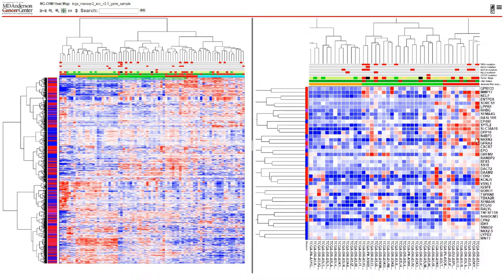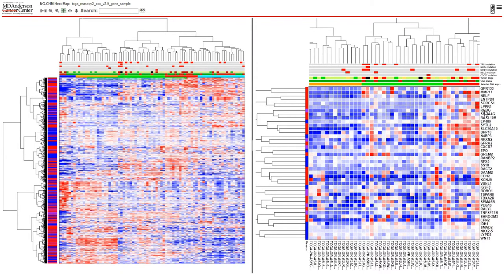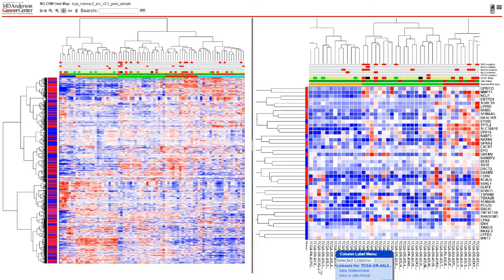The available menu entries depend on the type of data in the map. In this map, row labels are gene symbols, so the row label menu contains link outs to gene information. In contrast, the column labels are TCGA sample identifiers, so the column label menu contains link outs to information about TCGA samples.